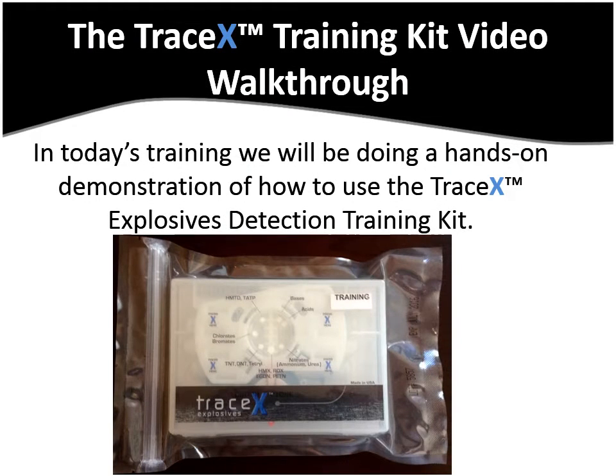In today's training, we will be doing a hands-on demonstration on how to use the TraceX Explosives Detection Training Kit.